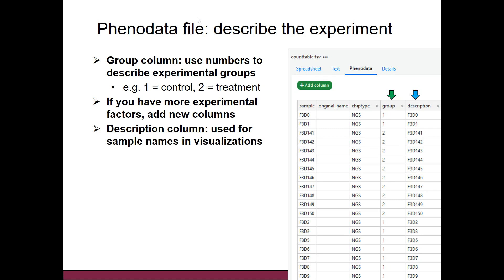If you have text, it's going to take the text in alphabetical order, which can cause problems later on. You can obviously have more groups than just two — you just add more numbers and assign your samples to those groups. If you have more experimental factors — not just one thing, but several, for example time, dose, or whatever — then you can add new columns. You give a name to the new column and then, using numbers, describe the value for that additional experimental factor.